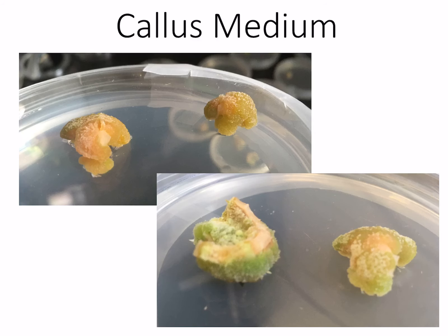Here's some callus medium up close. We can see that it's growing. In the lower right-hand one, you can see right here the original piece of tissue that was introduced onto the medium, and you can see all of the callus cells that have grown off of that piece of tissue.